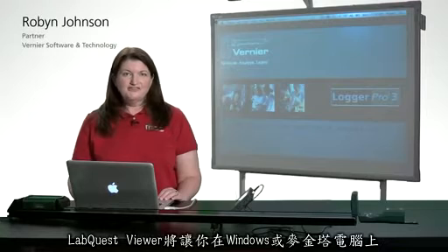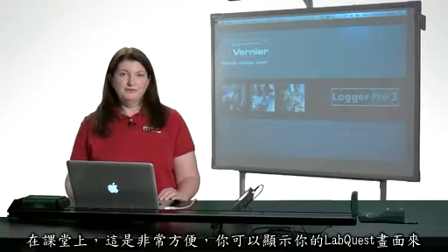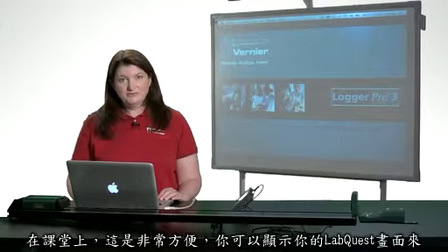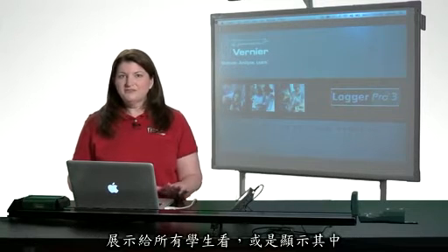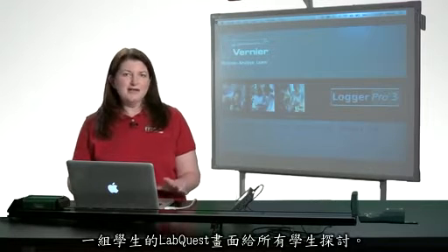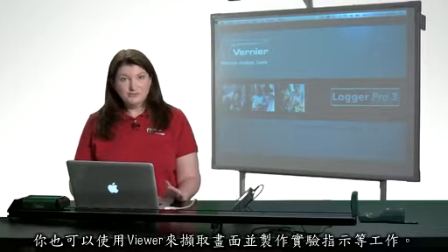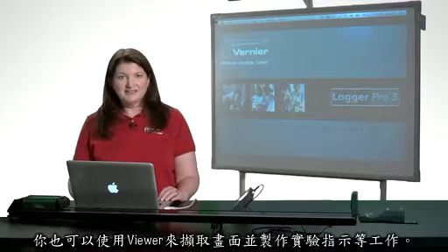The LabQuest Viewer allows you to view and control a LabQuest screen right on a Windows or Macintosh computer. This is very handy in the classroom, as you can display your LabQuest screen from a demo in the front of the class, or maybe show one of your student groups' LabQuests up for the whole class to see. You can also use the viewer to make screenshots for lab instructions, things like that.